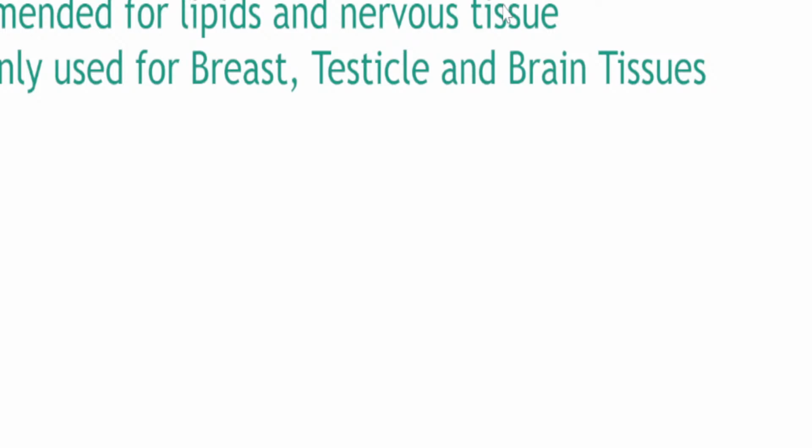Sir, do we need to remember the types of tissues? You should, but I've never seen a student come back to me and give me a post board exam commentary that they said, oh, all of the following are tissues tested with frozen sections. No, it's not like that. But this is based on experience, as well as what I looked at in the BOC manual for histotechnologists.